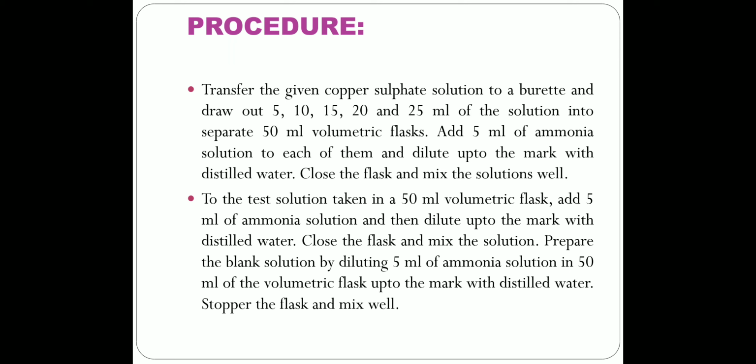You can see that there is an appearance of the dark blue color, and that dark blue color is because of the formation of complex. Once the 5 ml of copper sulfate and 5 ml of ammonia is added, then it is diluted with double distilled water and the volume is made up till 50 ml.